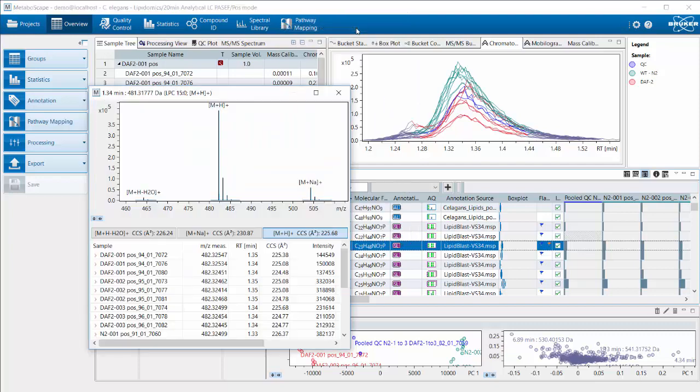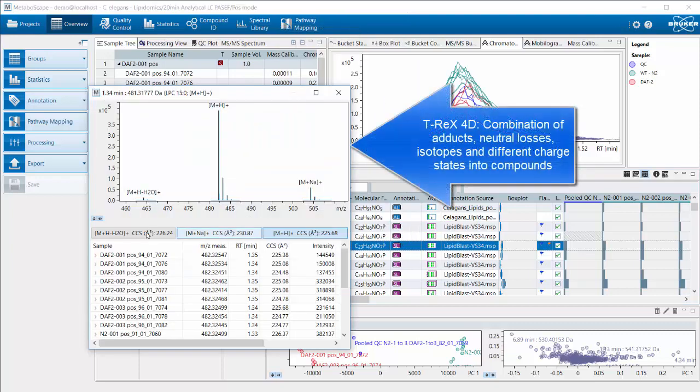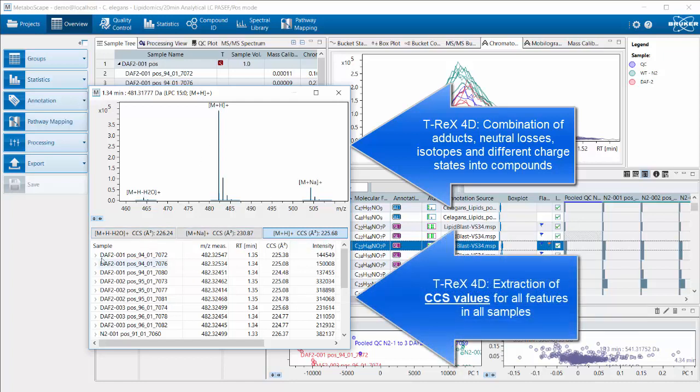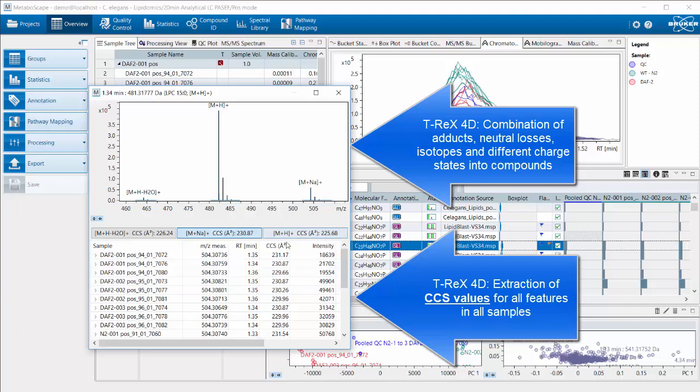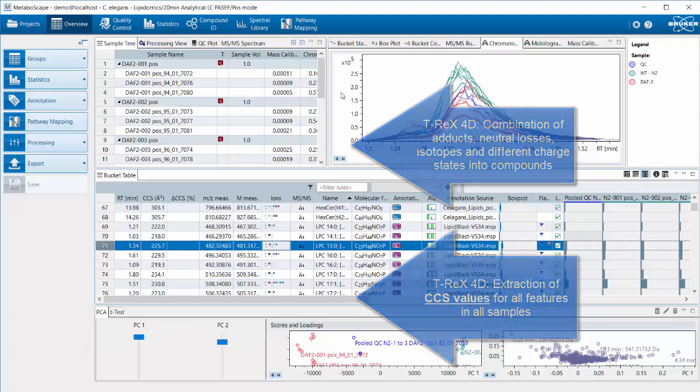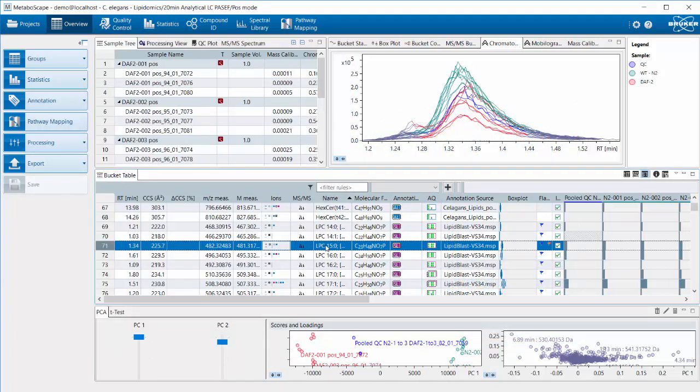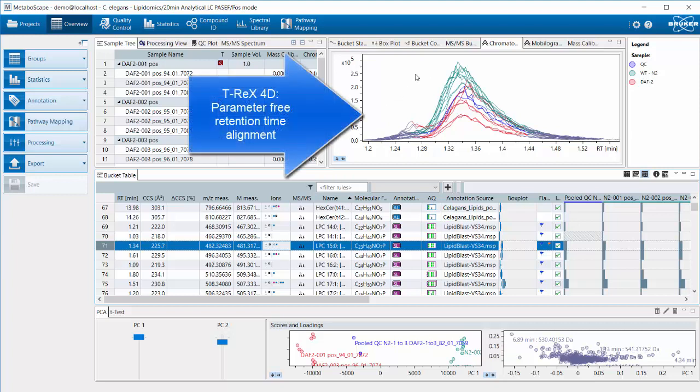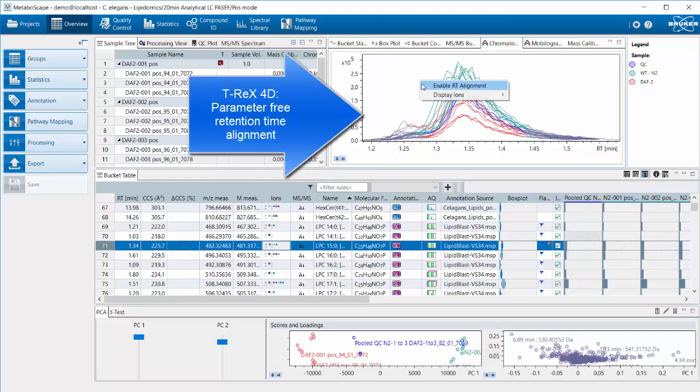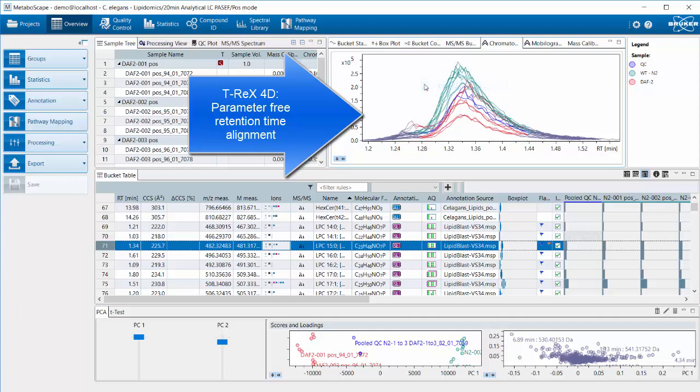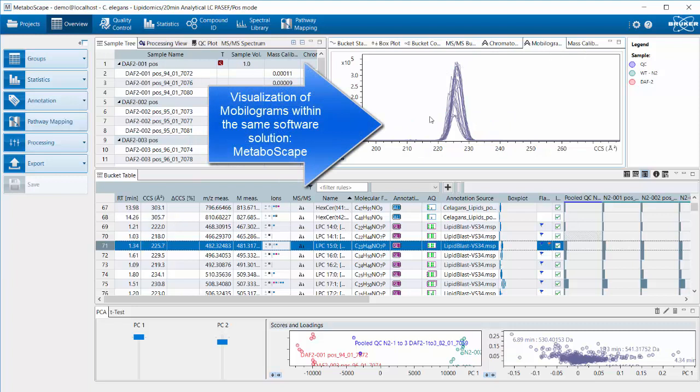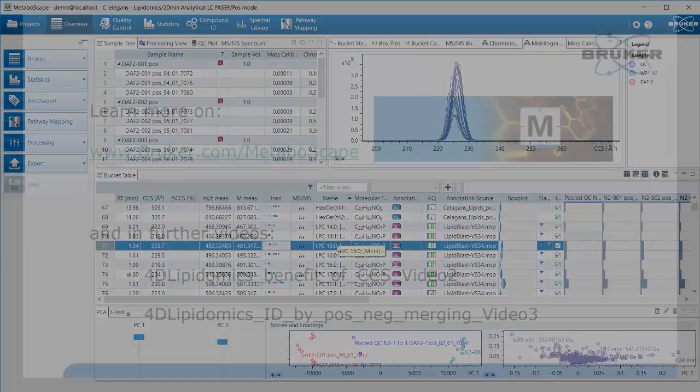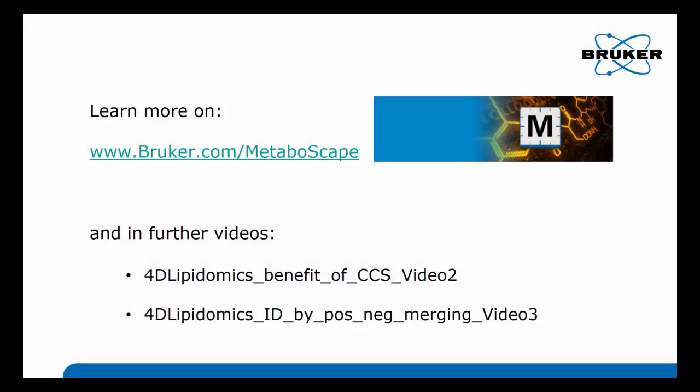The T-REX algorithm, if I show the compound information for one compound, actually combines the adducts, water loss, M+H, M+sodium, and the different isotopes as you can see here, as well as the CCS values. They are all extracted for all the features. You can also see that the retention time for the compounds is shown in the one I selected, and you can enable and disable the retention time alignment in this graphical view. Mobilograms are also created within the very same software package, and this is the basis actually for high-confidence ID, which is part of another video.